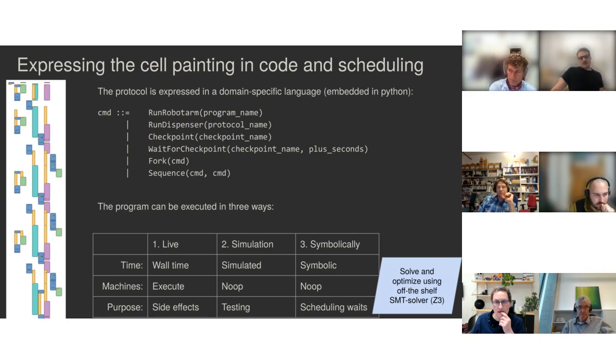This has been very useful: before you run an experiment, you simulate the whole program and try to reach all points in the program to catch bugs. So you run the whole program until you come to the point where you make the remote call to the machine and you say, oh, it succeeded.